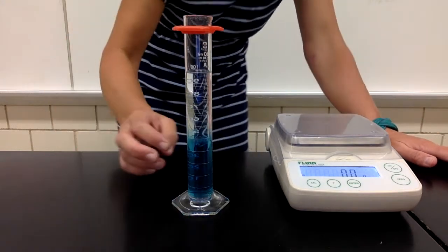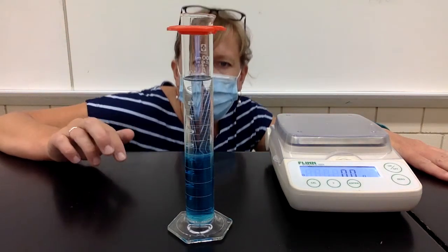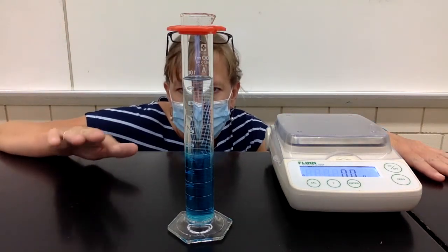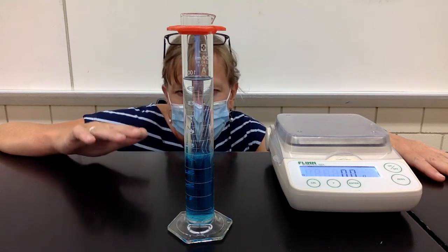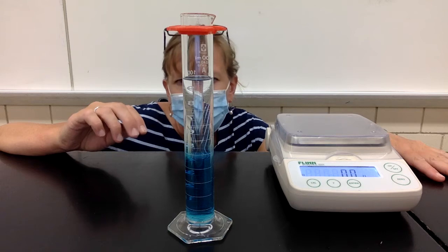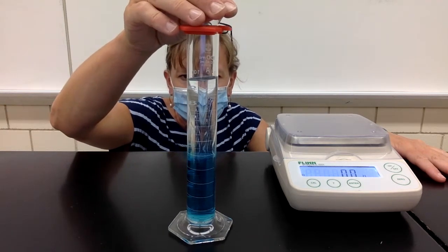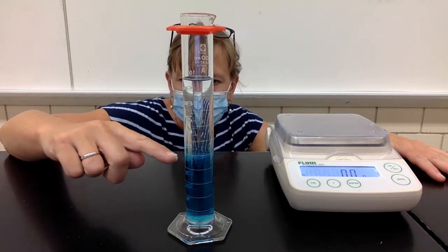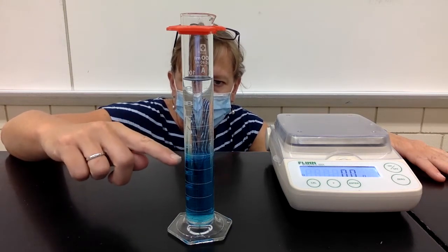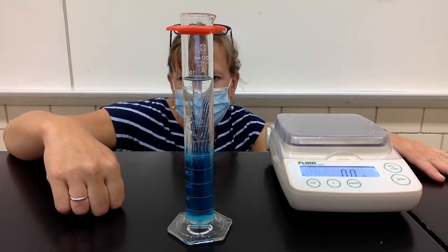I can see that there are a few very, very small bubbles kind of moving around inside of the ethanol. I don't see much in the way of bubbles in the water, and when I move this graduated cylinder, I can see the interface, the division where the two liquids come together, moves a little bit, but they still haven't mixed.